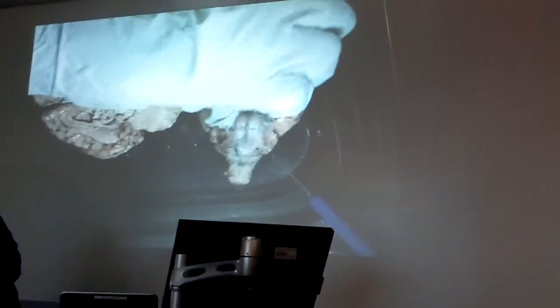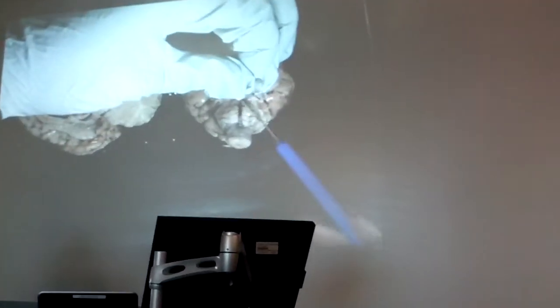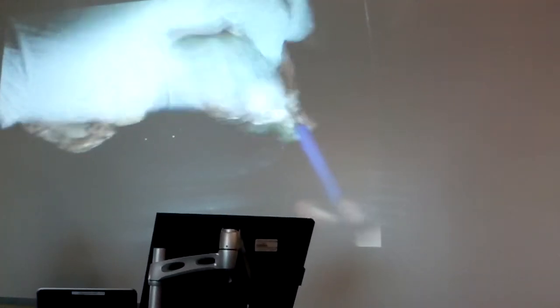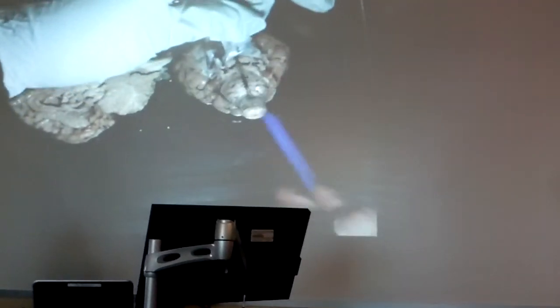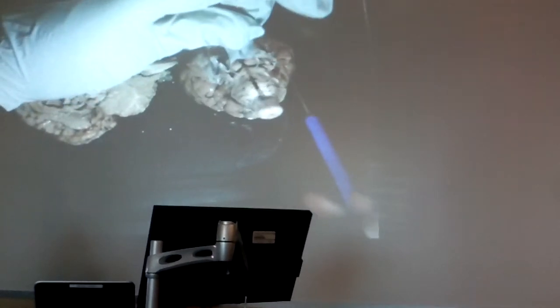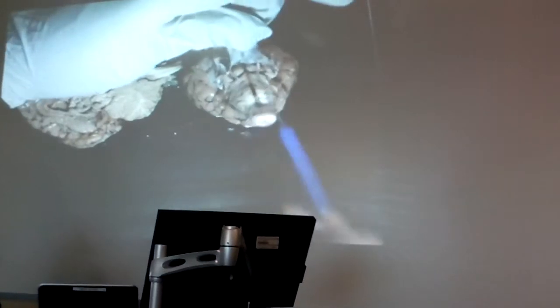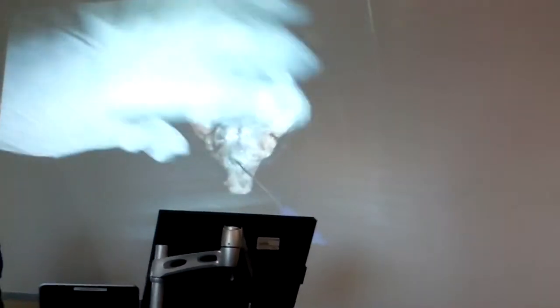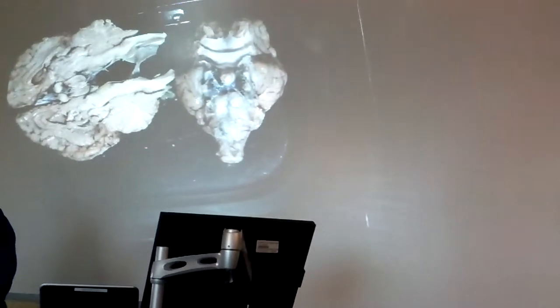Many times they'll come up easily, some of them won't. Mr. Gilmore, what are you holding it by? What's that tough stuff called? That's the dura mater. We talked about it. That's the dura mater. It's real tough. Mine's still intact pretty good.